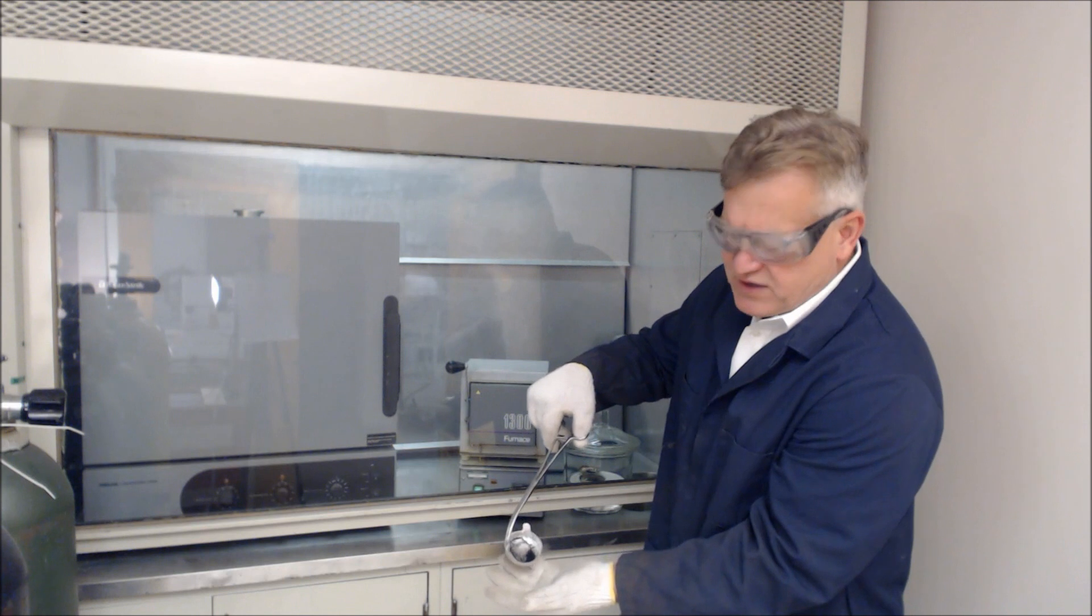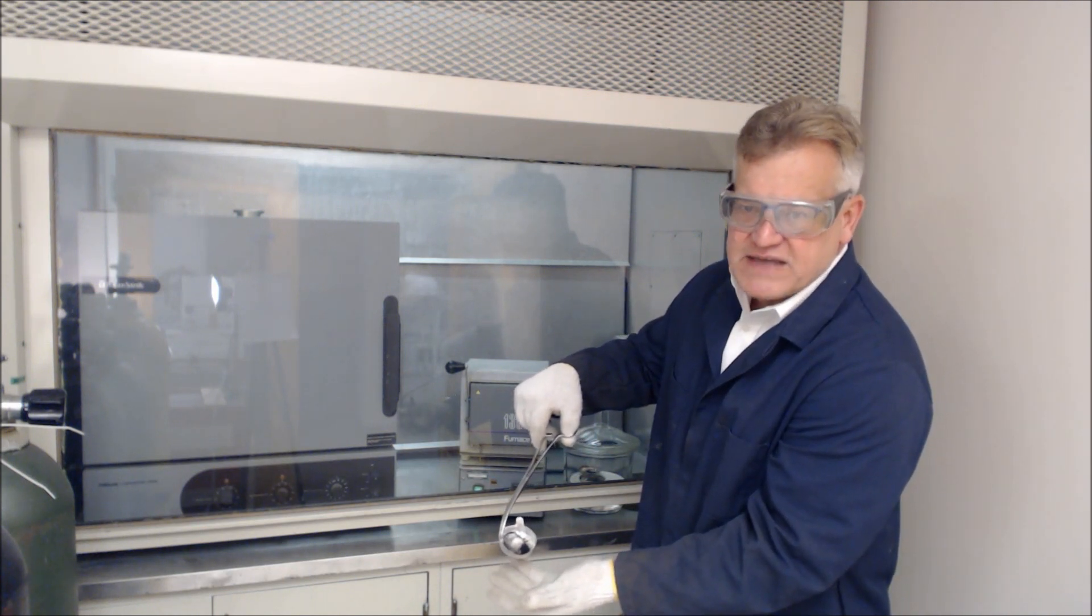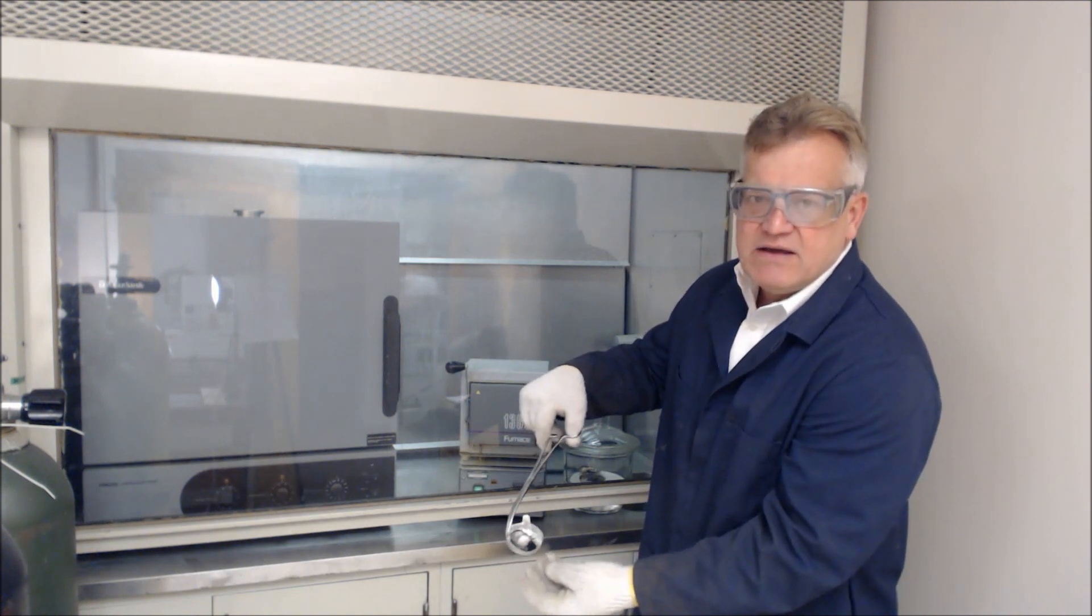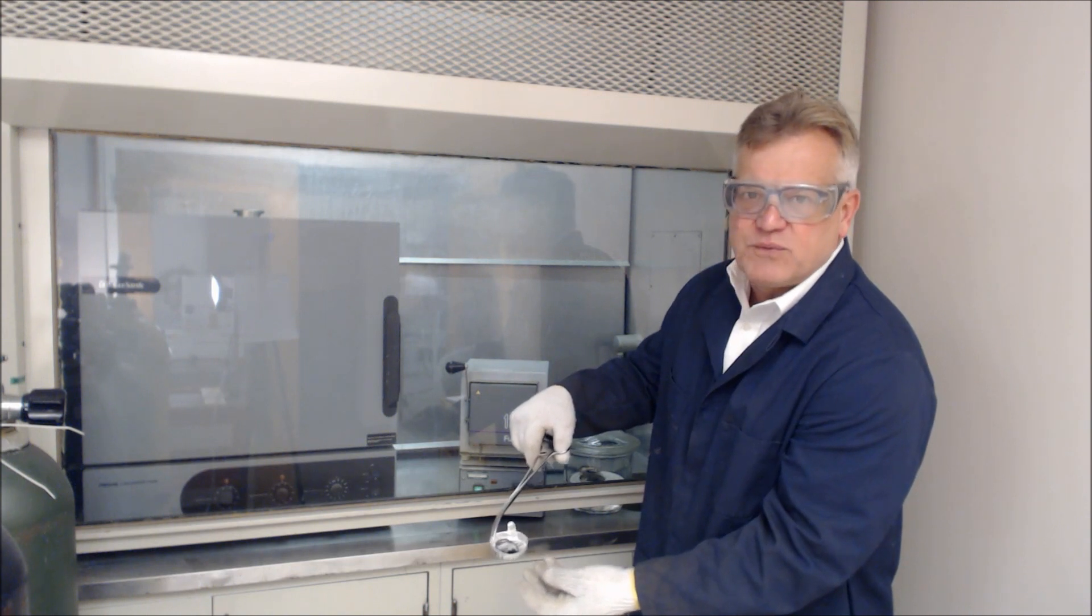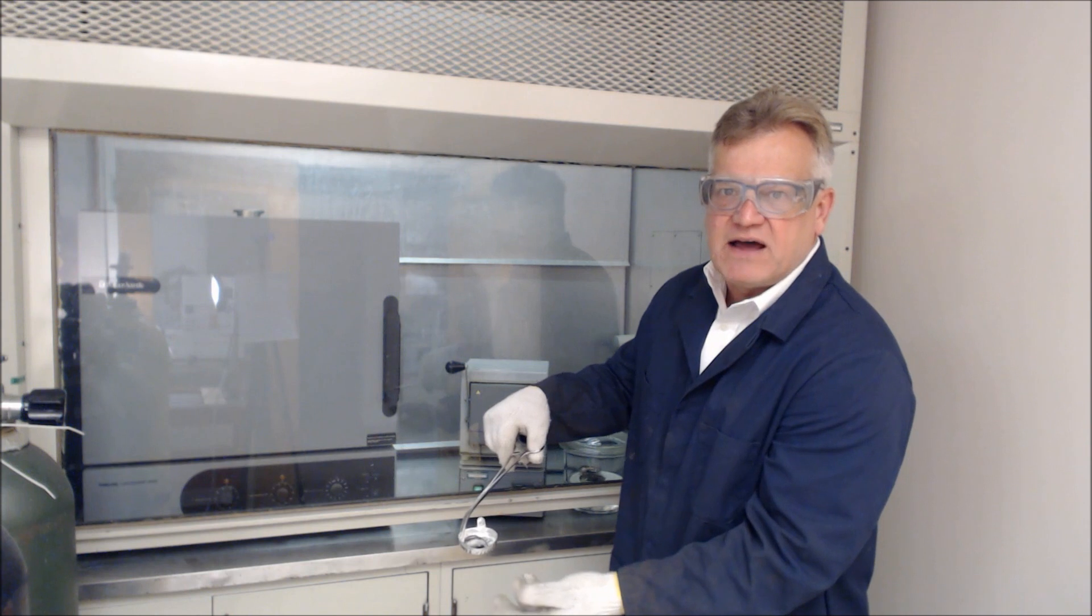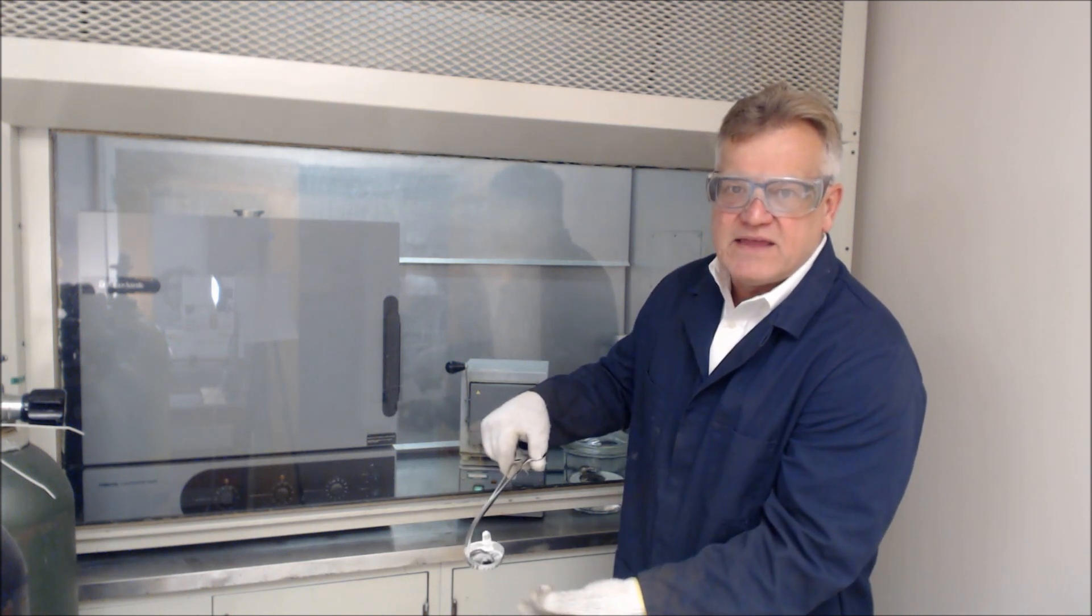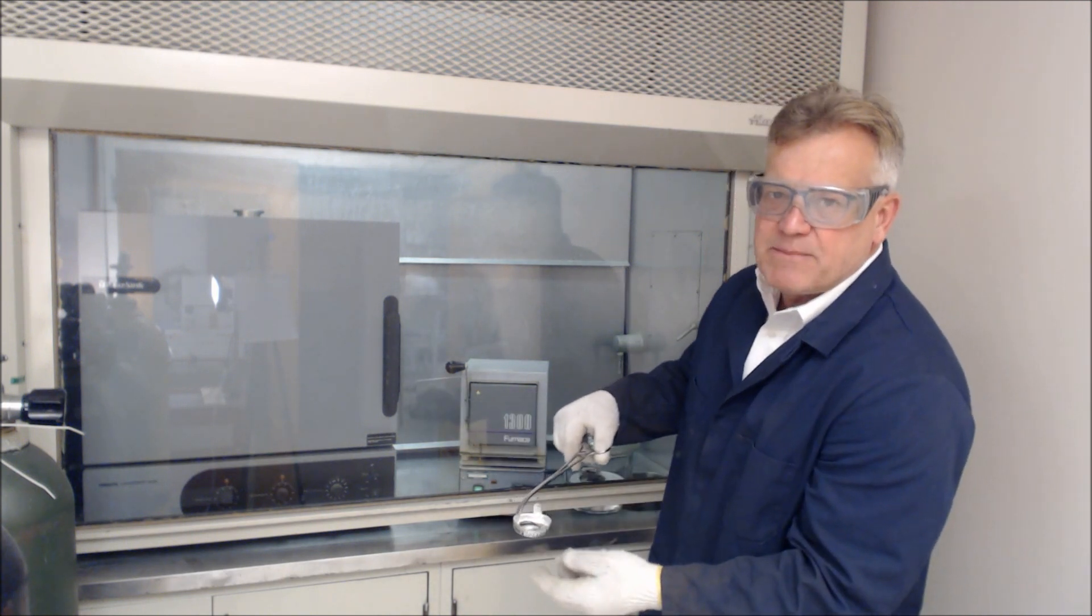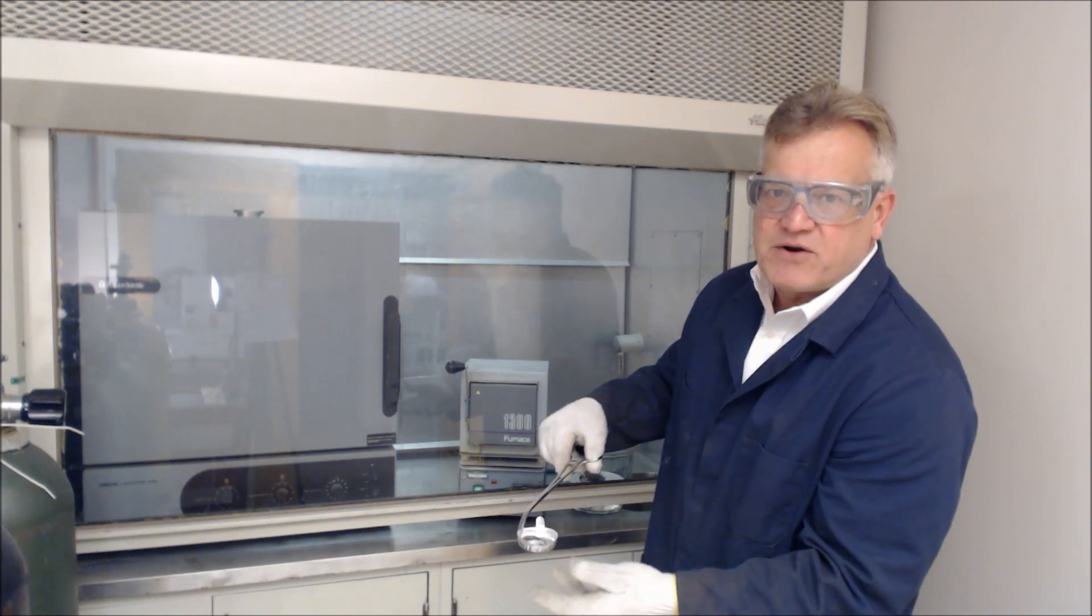Please realize that there are two different tests that are run here: muffle furnace and tube furnace. We could also go for ash content, which is a secondary burn of these materials. It's typically what you do with polyethylene which has been stabilized with titanium dioxide. So you go for a primary and then a secondary burn. We now have to wait for two minutes and then go over to the analytical balance for determining the mass of the sample after the burn.